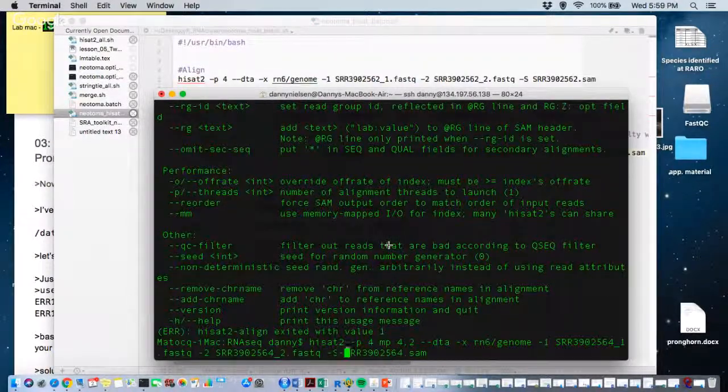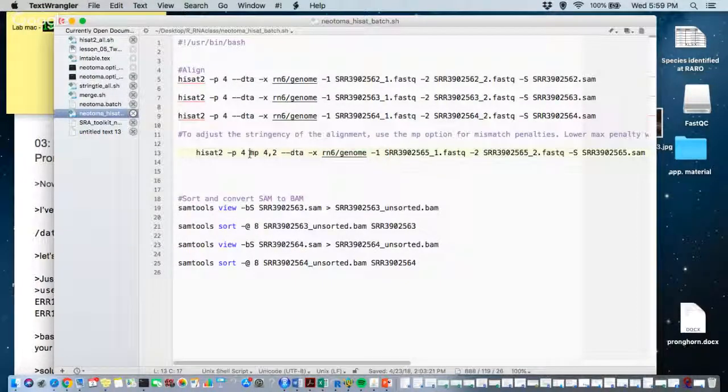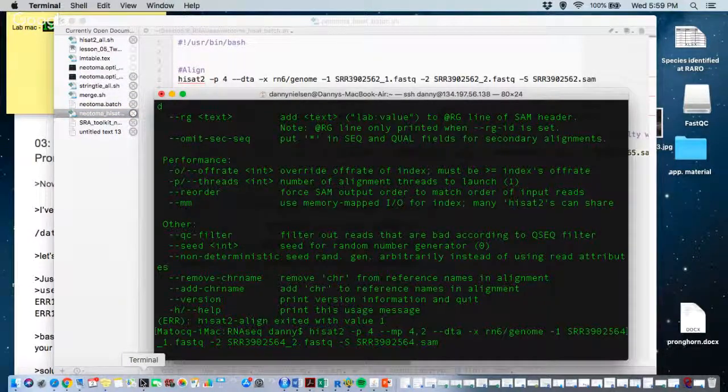So failed to. All right. Dashes. Okay. Yeah, I just forgot the dashes here, so I need to include that. Any of these options you need. I think I just forgot these two dashes. So that's going to take a little while, and I'll just let it run.